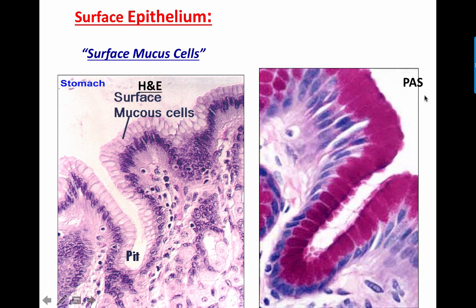When stained with PAS (periodic acid-Schiff), which stains mucopolysaccharides, the apical part of the surface mucus cells stains magenta red, since mucus is a glycoprotein. As studied in first-year cytology, PAS stains glycogen and glycoproteins with this magenta red color. The cell is very tall with a basal oval nucleus, and almost the entire cell is filled with this mucus collection.